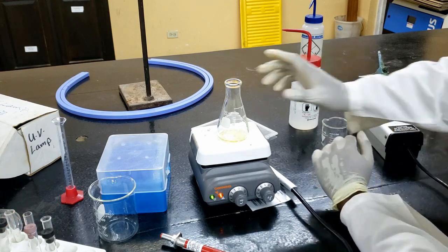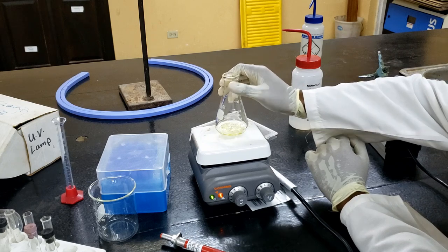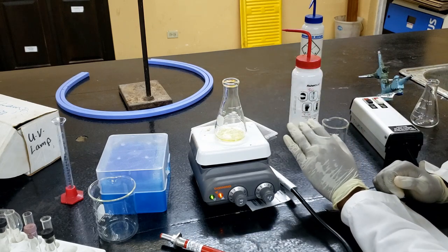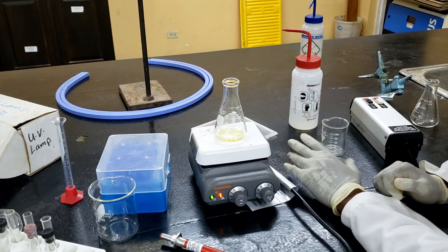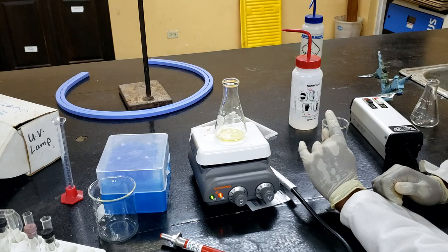So we're almost at our desired volume. We'll just allow a little bit more to evaporate off, and then we'll leave the solution to cool, and an oil should separate containing the o-bromonitrobenzene.